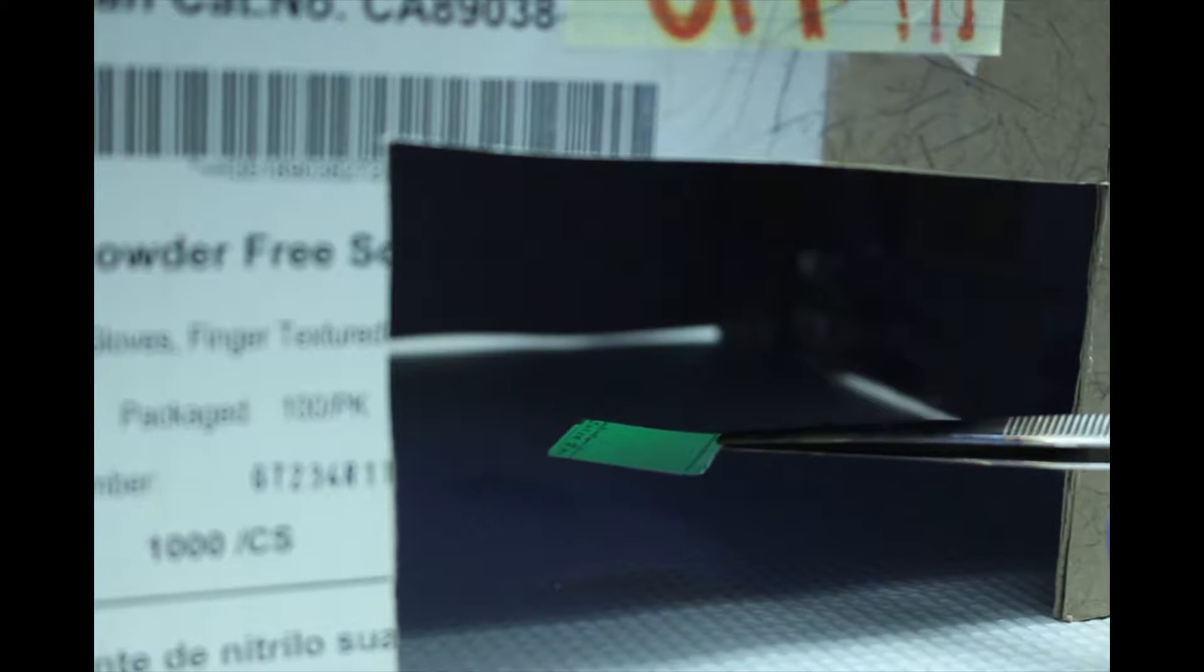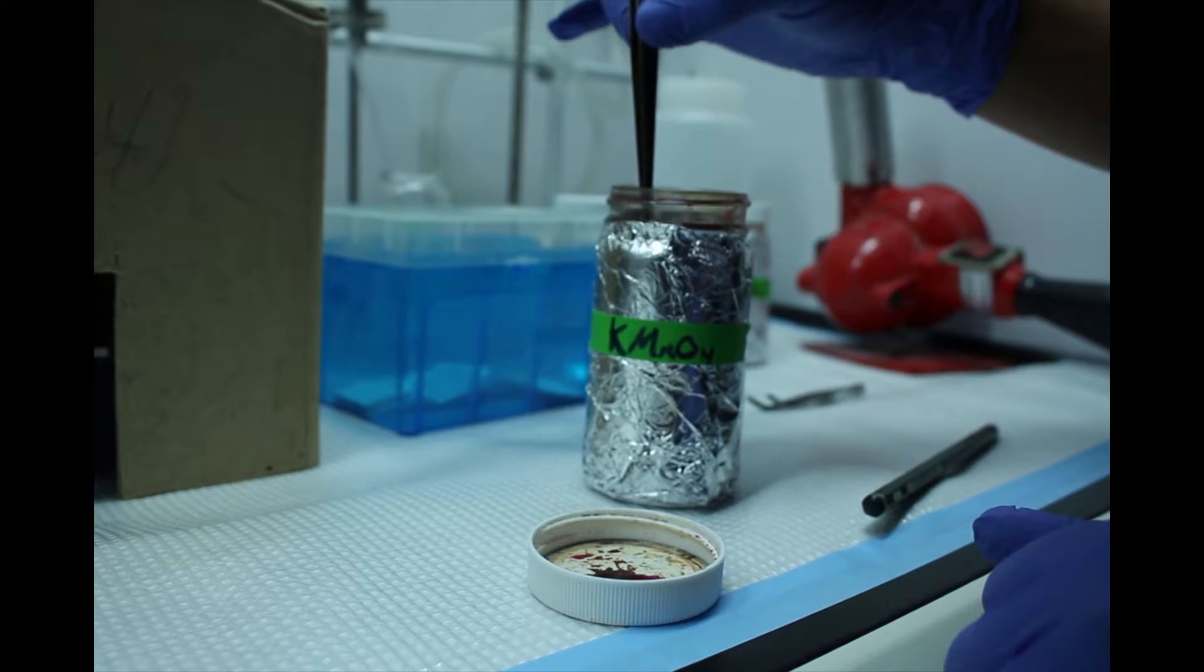Once the TLC plate has been developed in the chamber, the spots can be visualized by a shortwave UV lamp and a TLC stain.